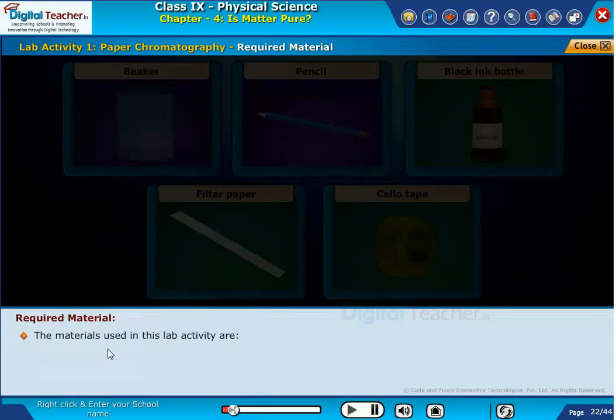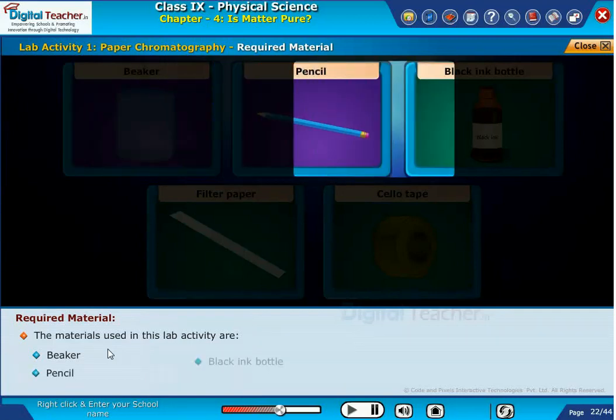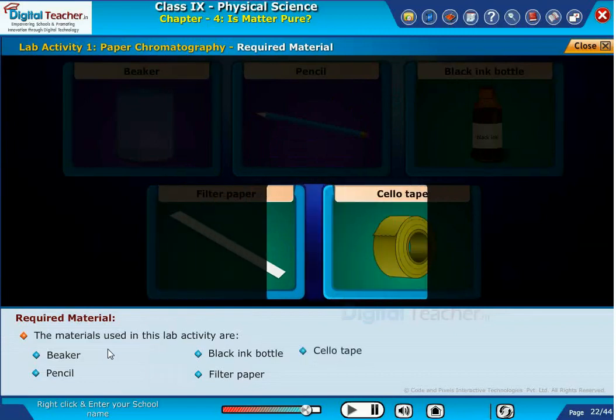The materials used in this lab activity are: beaker, pencil, black ink bottle, filter paper, and cello tape.